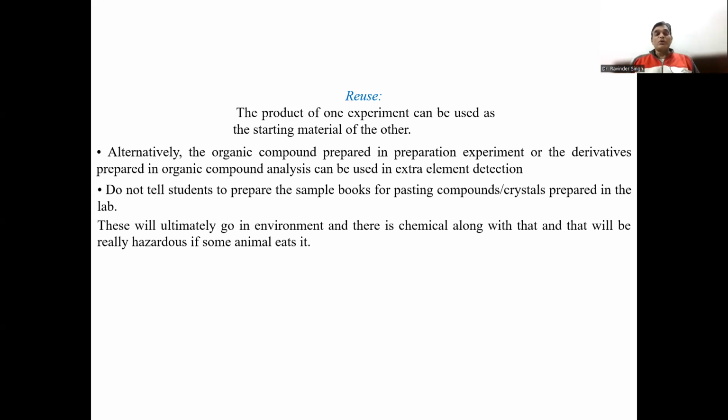If they touch that practical notebook while eating something else, that may be dangerous for them also. So never paste the compound or the crystal prepared in the laboratory in your notebook in the form of a sample.